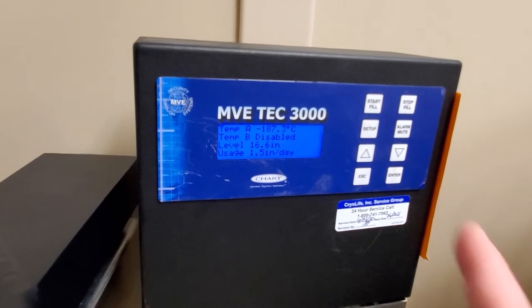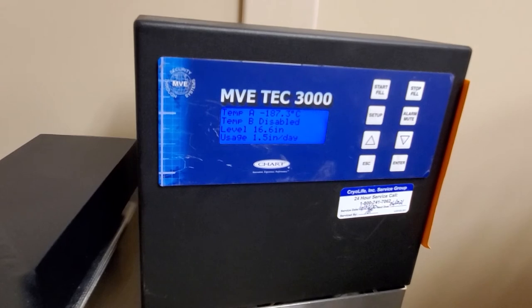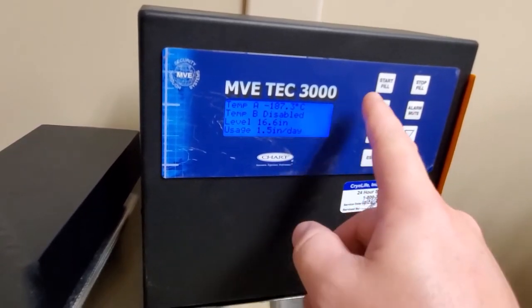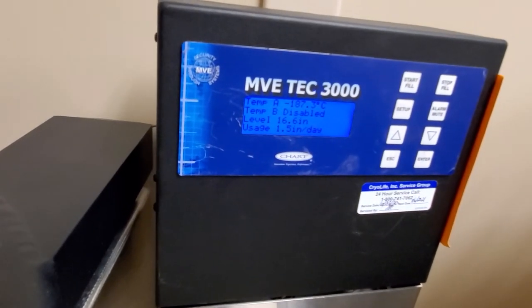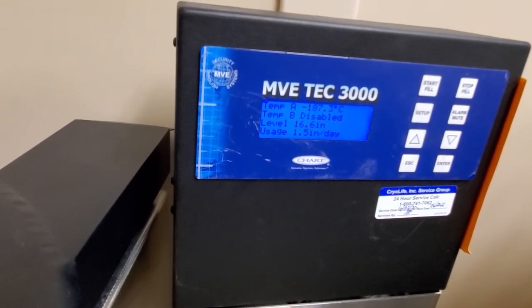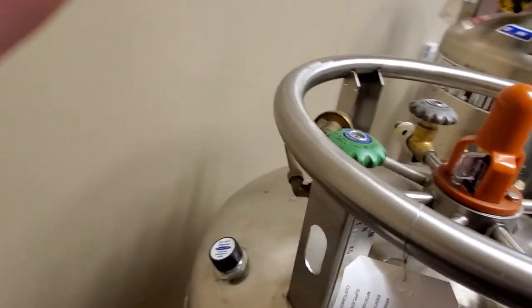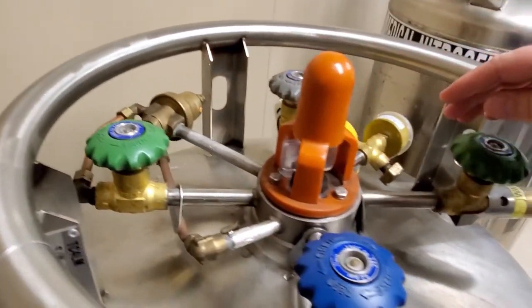Remember: if these units throw an error saying they need to be filled, what you're supposed to do is hit start fill and allow it to fill on its own — it will automatically time out and shut off. If it cannot fill, it's because either your cylinder pressure is too low, in which case you adjust this knob until your gauge reads 20 psi.